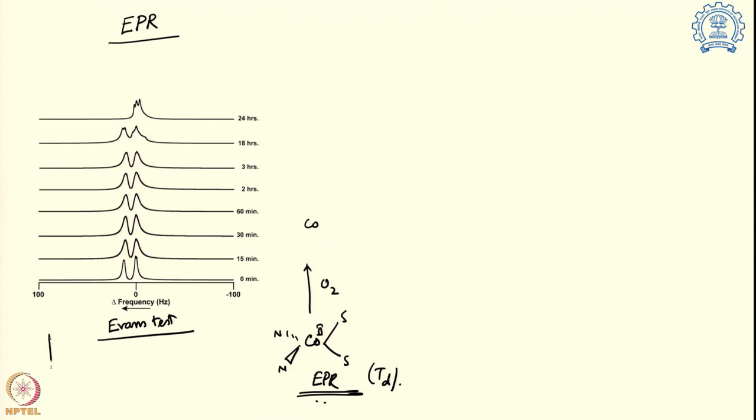So that is actually done by taking an NMR tube, and in this NMR tube we put two tubes together concentrically, one just having our sample and the other one having a blank solution. So the same solvent, one is with sample, one is without sample.